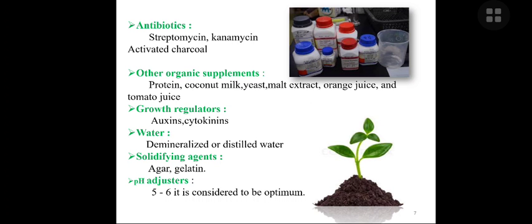Then other organic supplements like protein, coconut milk, yeast, malt extract, orange juice and tomato juice, etc. as growth supplements. Then growth regulators like plant hormones, auxins, cytokinins.